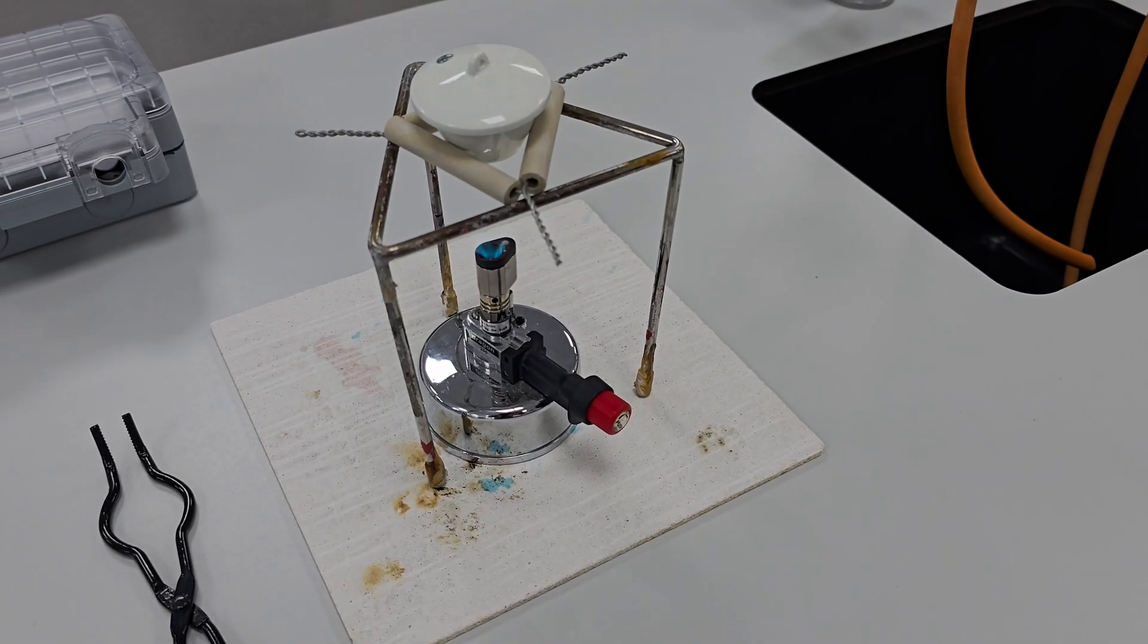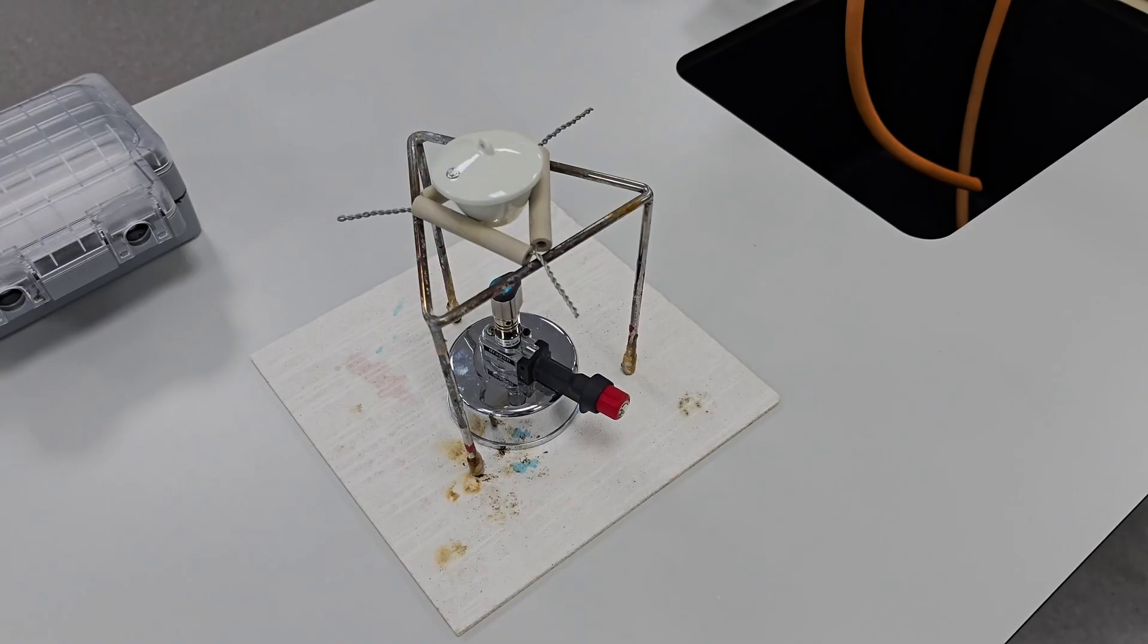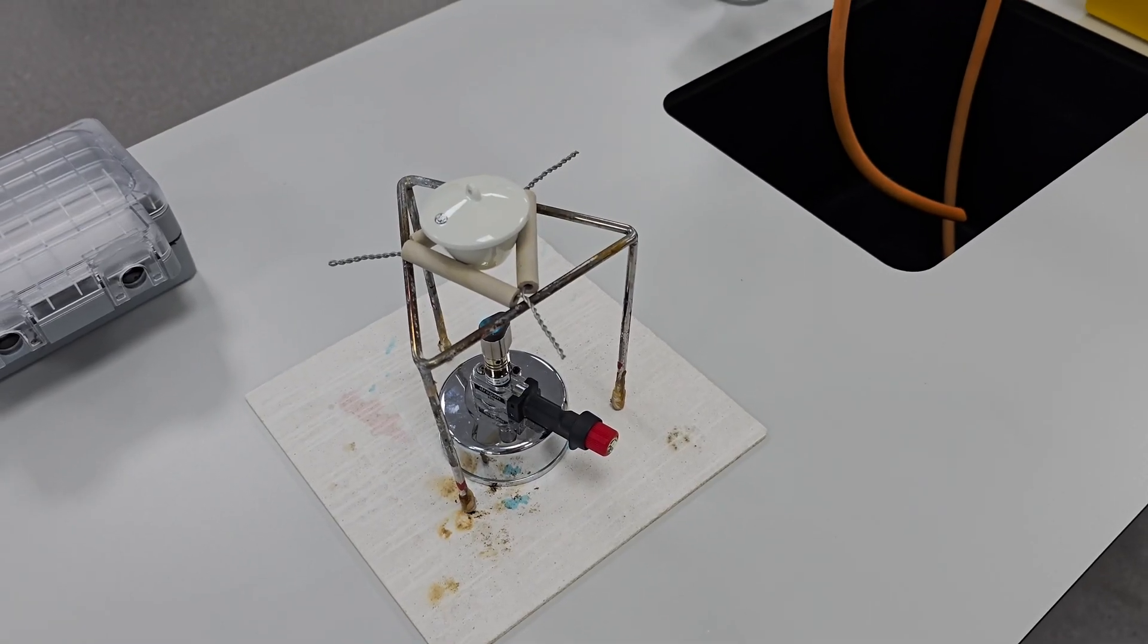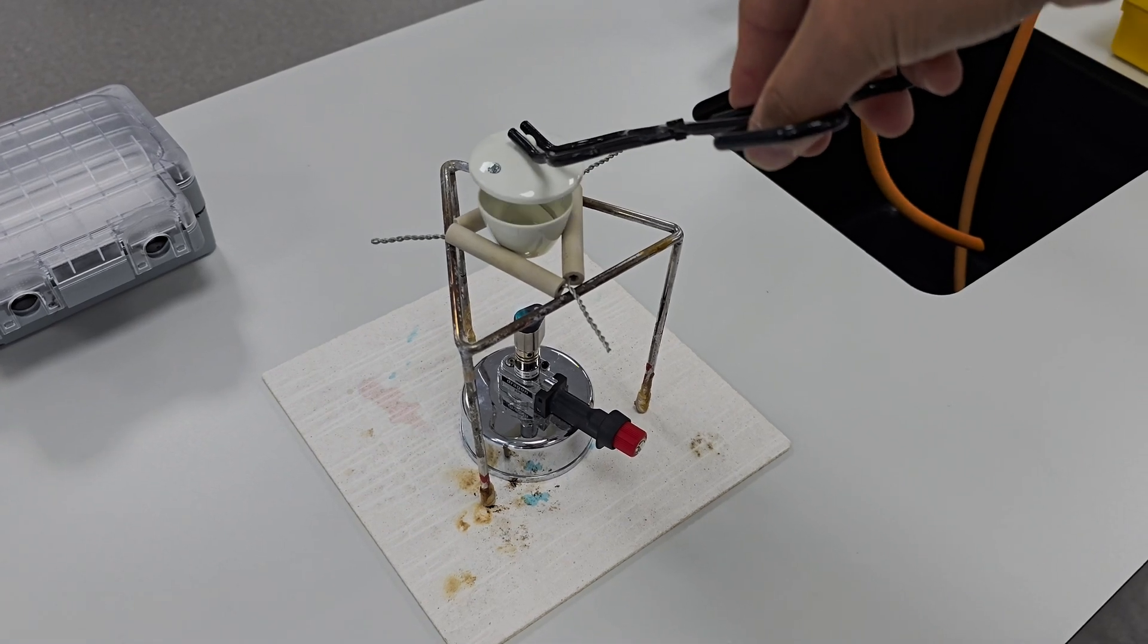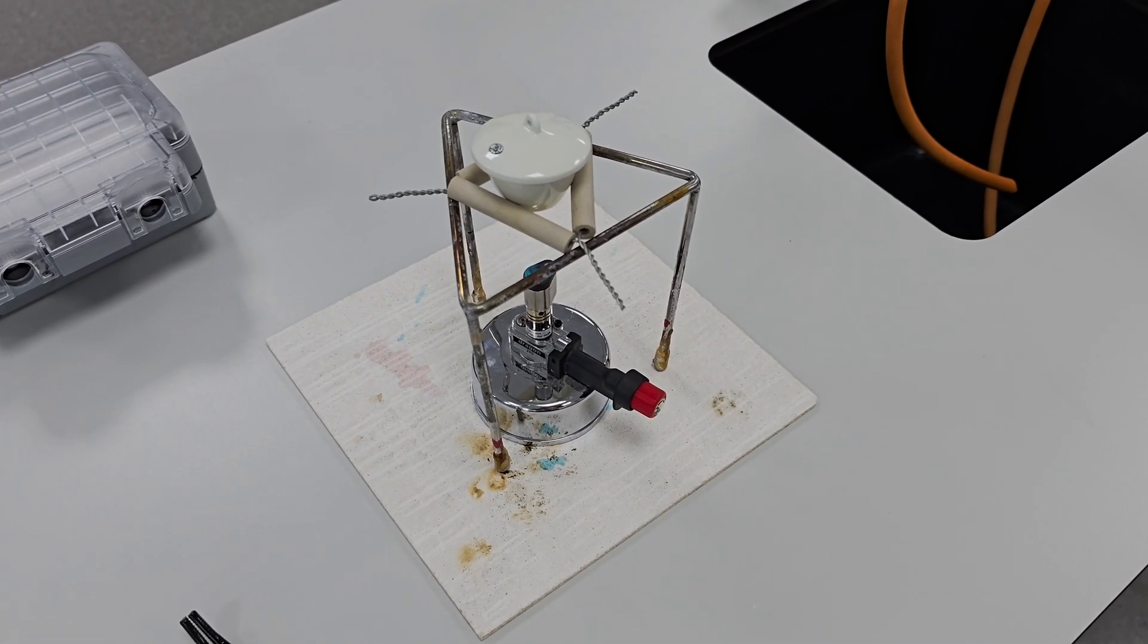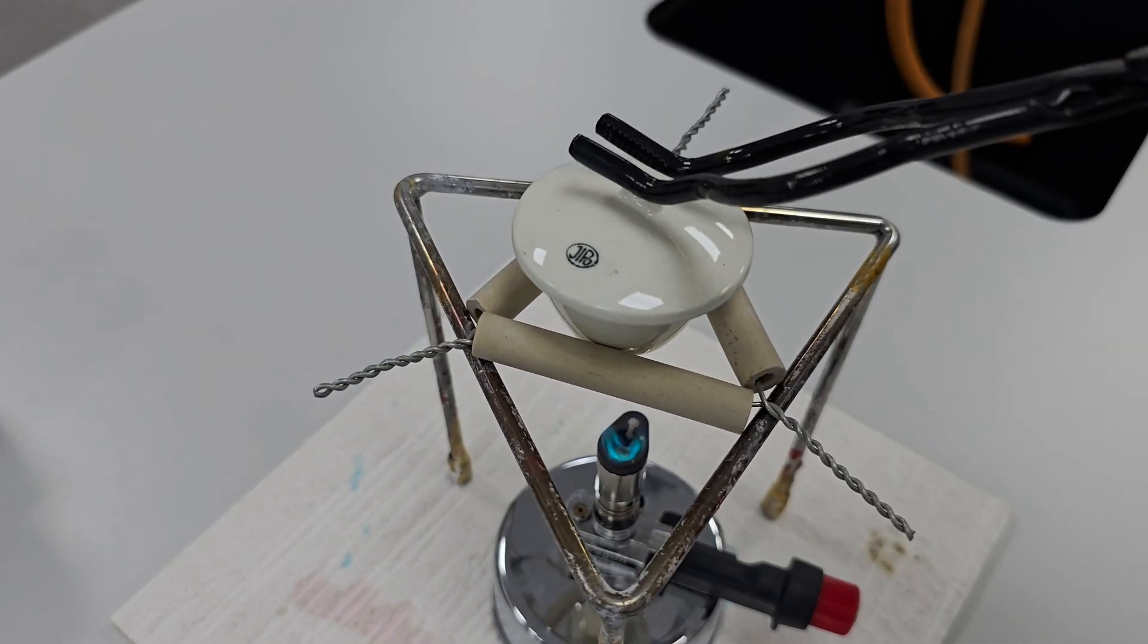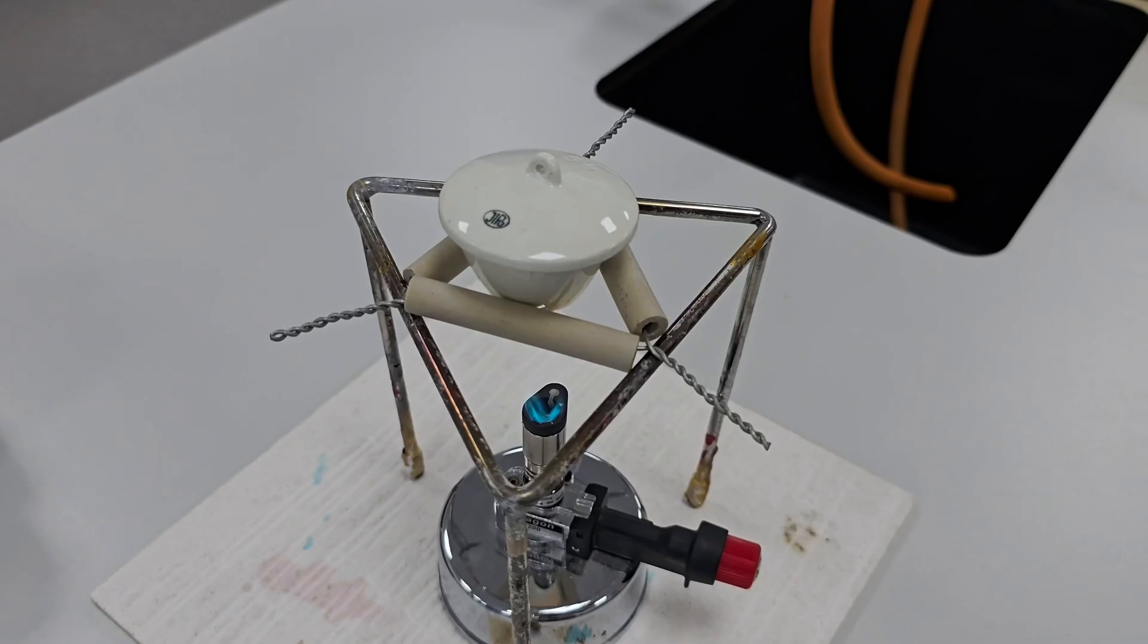Every 20 seconds I lift the lid slightly to let oxygen in. This is crucial because magnesium needs oxygen from the air to form magnesium oxide. If we didn't lift the lid there wouldn't be enough oxygen for the magnesium ribbon to completely react. You can actually see the magnesium glowing brightly every time we lift the lid. That's the magnesium reacting with oxygen in real time.